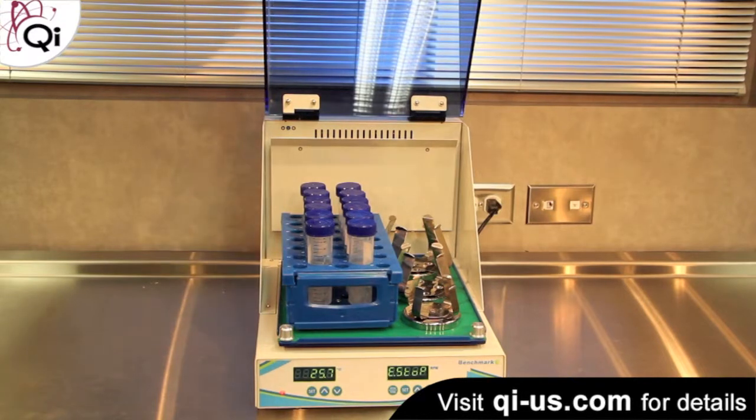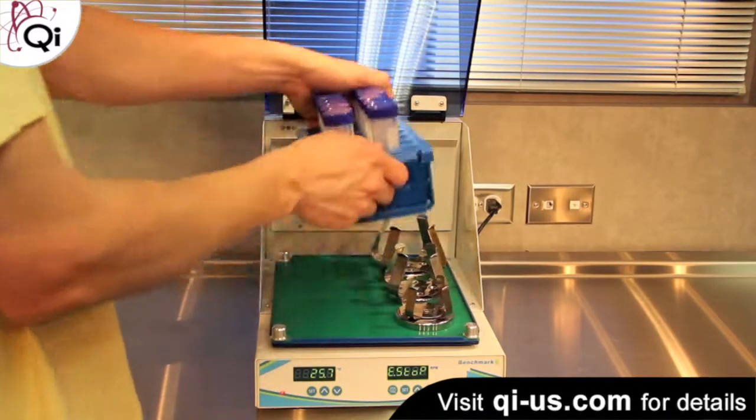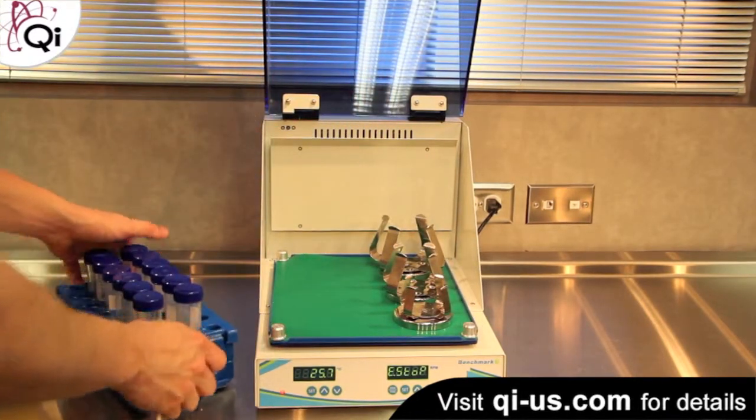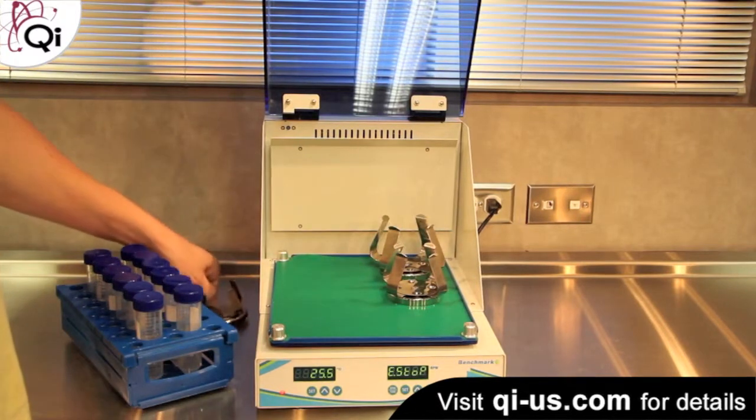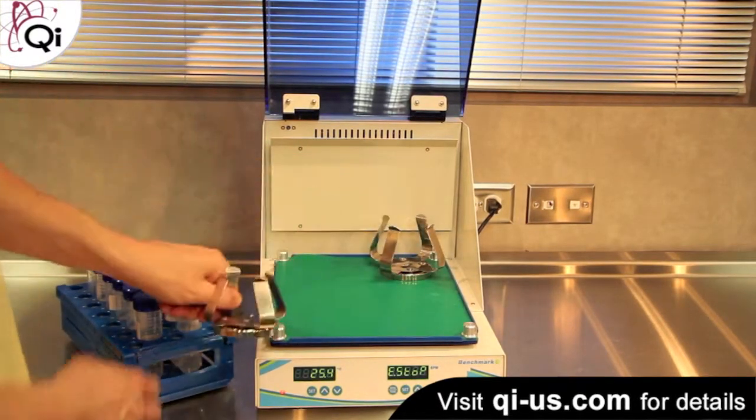The magnetic clamps used with the Magic Clamp system come in all the standard sizes and are strong enough to hold 2 liter flasks in our 10 liter unit.